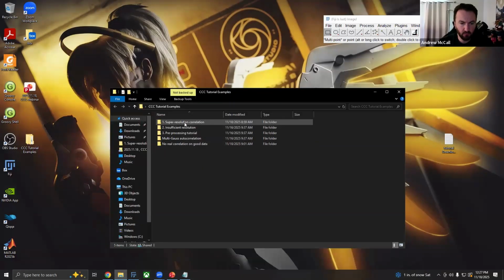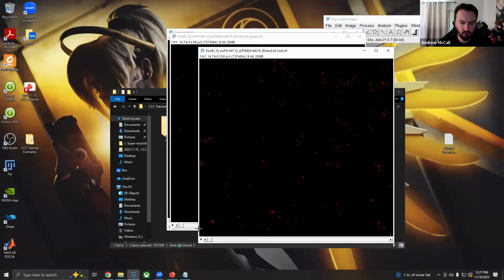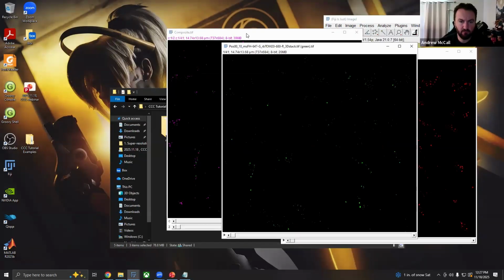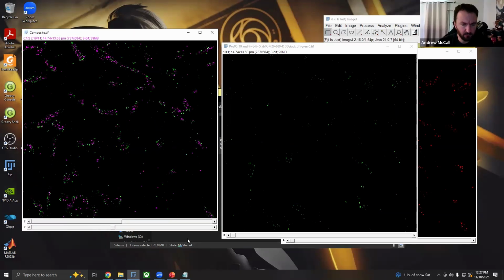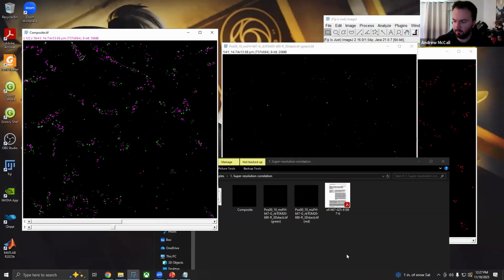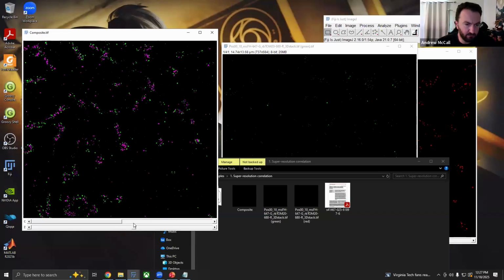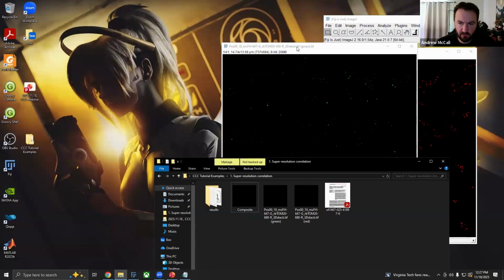So once you get the data, we're going to start here with a couple really basic examples. So the first one, and you don't have the composite, but I just want to be able to show you what this looks like. This comes from Andrew Rowe, one of his projects. He's in the lab of Trina Ni Kundela. I think I butchered that, but I made an effort. And this is actually STORM data where we're looking at mitochondrial proteins. So you can actually see there is a pretty strong correlation here.